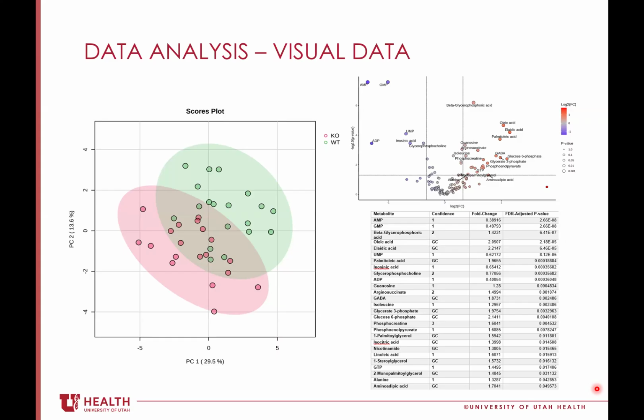Just imagine though a lot of study-specific batch effects, or what you guys have tuned on or other things in your LC type adjustment to really focus in on things if there's any bias. So trying to say what the pipeline was that was used, and also how it batch varies in your implementation of it. I think there's going to be so many batch effects, even within the same lab running the same assay on different organisms or cell types, that it would be difficult to do. But I understand what you're trying to get at. It would just be an incredible amount of work.